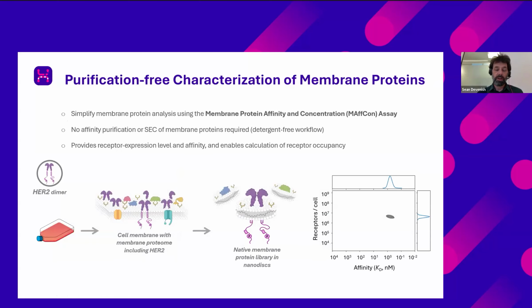And then finally, in this section, I'm going to talk about membrane proteins. So obviously, membrane proteins are a very important class of therapeutic target, well overrepresented in the existing pharmaceutical world. Now, the challenge of working with membrane proteins is that obviously solubilizing them, they need to have this membrane or detergent environment. And even just determining what detergent is suitable for any particular membrane protein is really a whole project in itself. So solubilizing them is difficult, purifying them is also difficult.